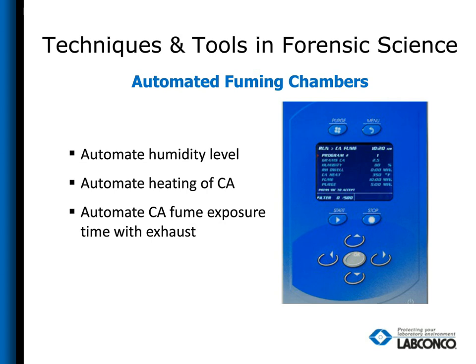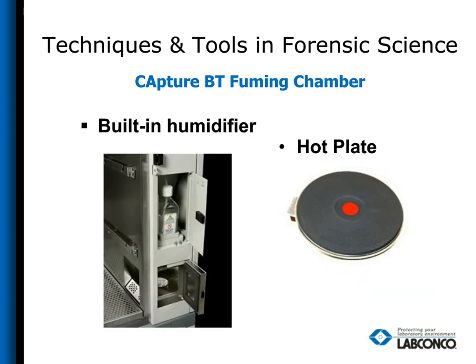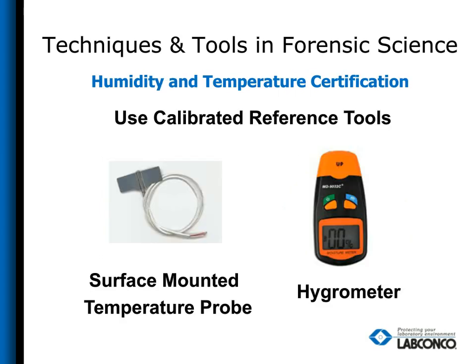With automated systems, you need to be able to get inside and actually verify your built-in humidifier and your hot plate with a surface temperature probe or hygrometer. This is important also for the labs that are ISO 17025 and 17020 for your performance checking for your evidence processing.